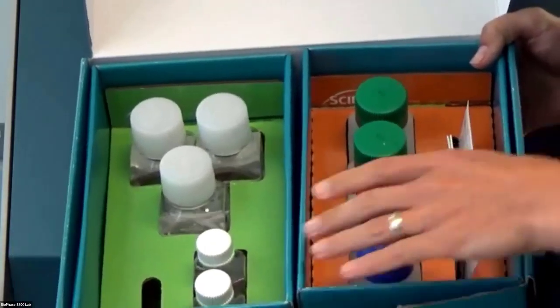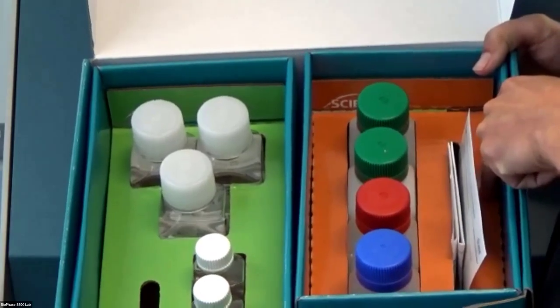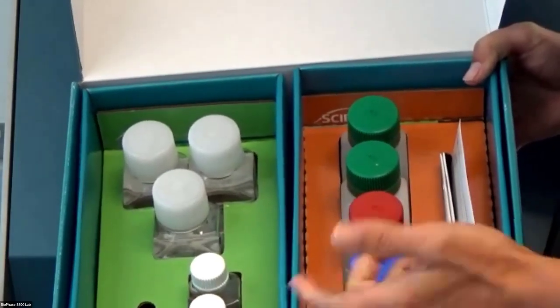Now, we'll also see that even the boxes are color-coded. So here we have the orange box, that's color-coded for ambient storage, green box, color-coded for refrigerated storage. So everything is very color-coded.